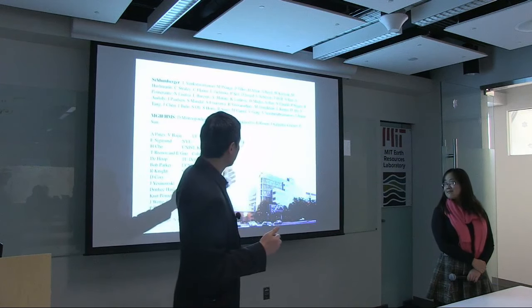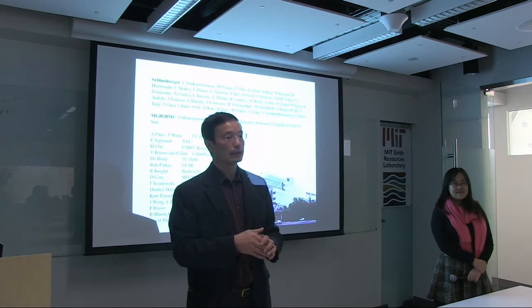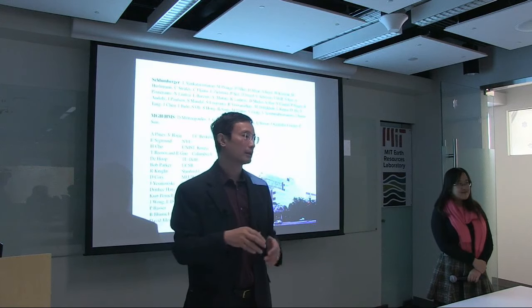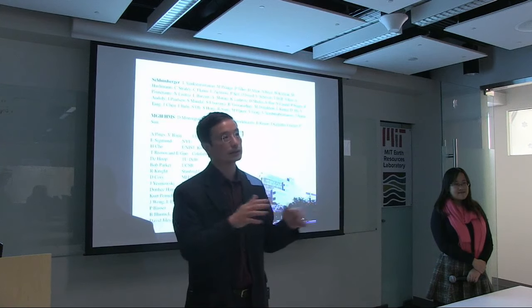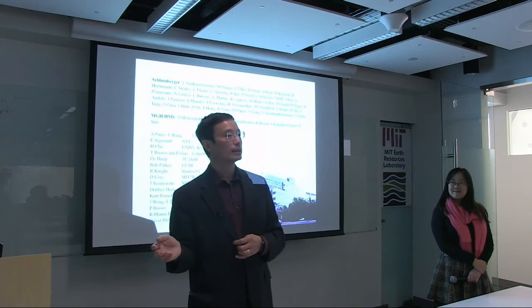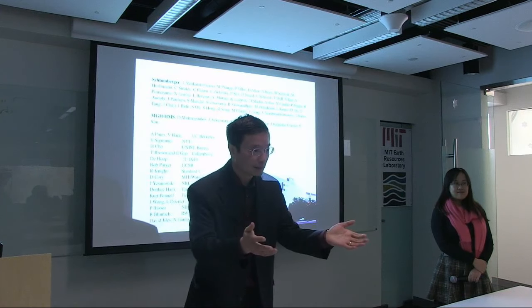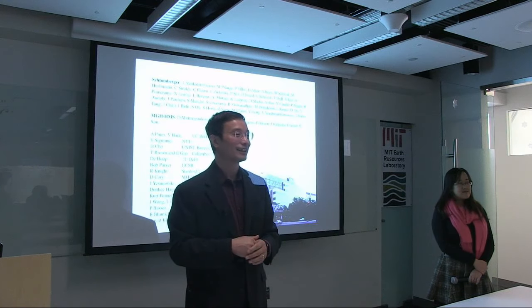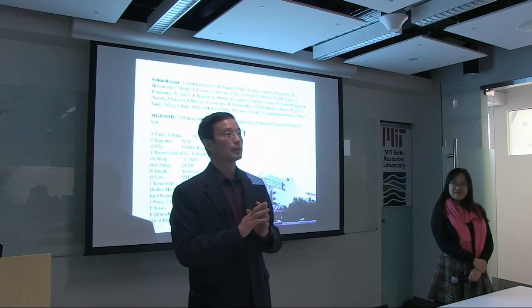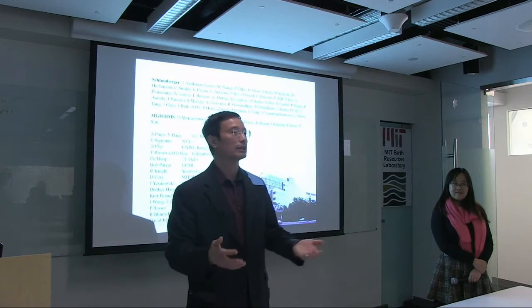Like in the logging system, the magnetic field is not uniform, so it has a much broader bandwidth. And in that situation, it's not frequency to the second power. In fact, within a range, it's actually not very sensitive to frequency. There are many things. We are right now doing NMR at half a Gauss. So you know what half a Gauss means, right? About the Earth's magnetic field. Yes. Right. So you can do NMR at Earth's magnetic field, so there's no intrinsic limit. It's just signal-to-noise, and depends on your application, how quickly you need the data.